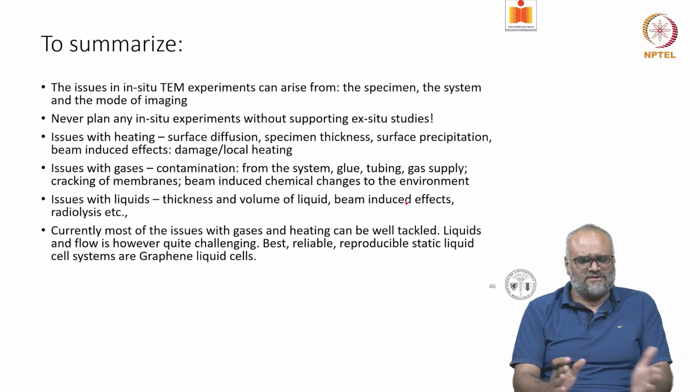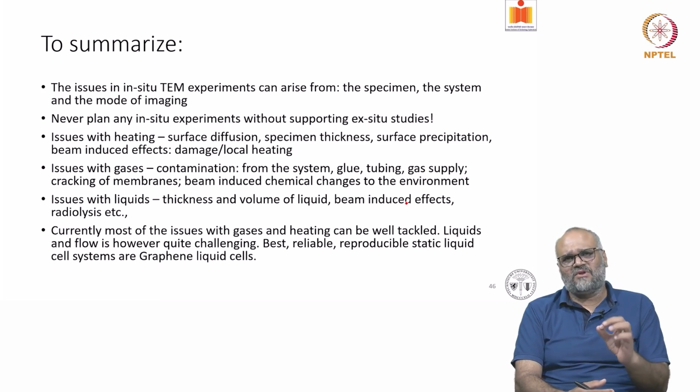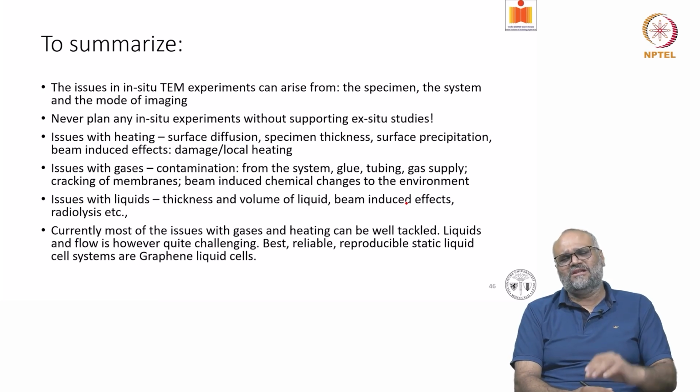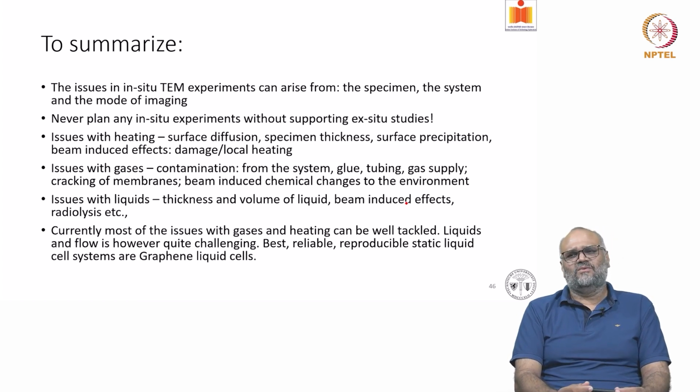Use in situ microscopy as a tool where you are looking to solve some specific problems which can only be studied with these kinds of studies. So with that, I'd like to end this discussion, and I hope you got a flavor of the advancements beyond conventional imaging in transmission electron microscopes.